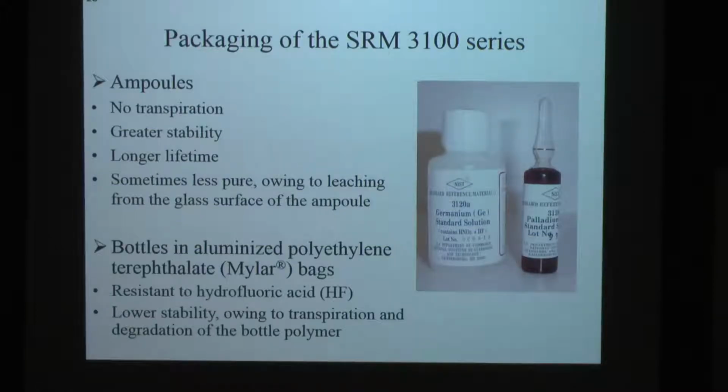And how do you make them? Well, first, how are they packaged? If you put it in a bottle, the bottle is porous. If you leave it around for a few years, some of the water will evaporate and the concentration will increase. So we only use plastic bottles for solutions that, for example, contain hydrofluoric acid that would attack glass. The solutions that are not containing hydrofluoric acid and not containing alkali, which also attacks glass, are sold in ampules. Less user-friendly because you can break it open and then the glass shard hits your finger, you've cut your finger, you've got a safety incident, you've got to talk to your boss and your boss's boss and everybody has to go have safety training and everything else. But it is stable. It is stable, albeit less user-friendly.